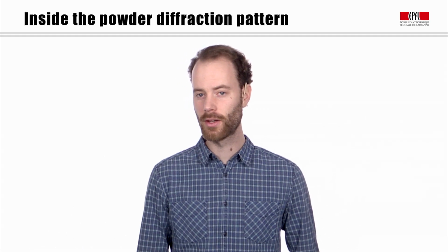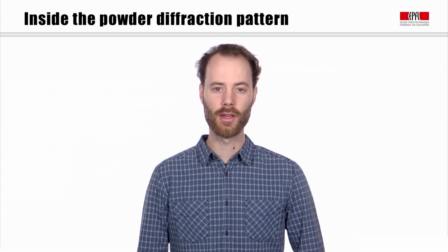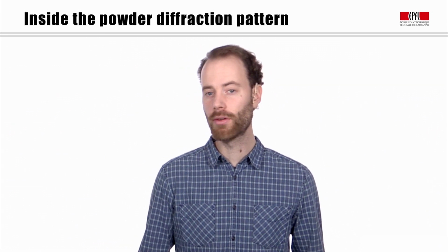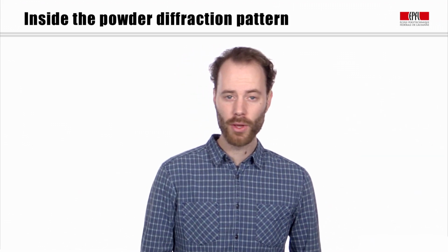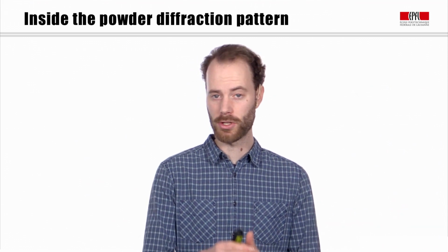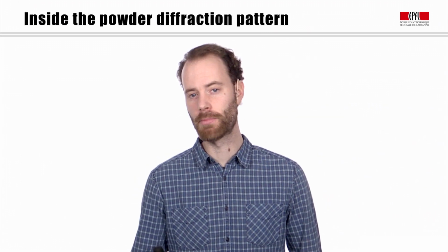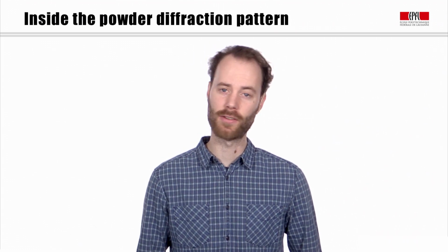In this session, we will have a closer look at what information is contained in the powder diffraction pattern. We will look at the properties of the diffraction peaks or Bragg reflections that make up the diffractogram. In brief, we will introduce what material properties determine the position, intensity and width of the peaks in the powder pattern. We will need this as background knowledge to help us take the right decisions in data analysis and interpretation later.